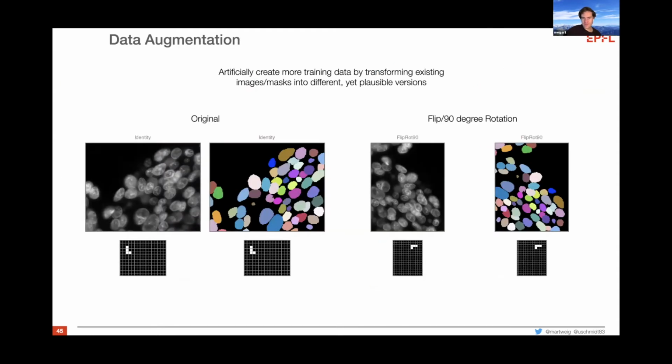One thing that you will see in the notebooks and the tutorial notebooks is something called data augmentation. This is just a way to artificially increase your annotations that you made of your ground truth objects and present a network with slightly changed geometric versions, copies, during training, to artificially increase your data set. This could be, for instance, flips and rotations, right?